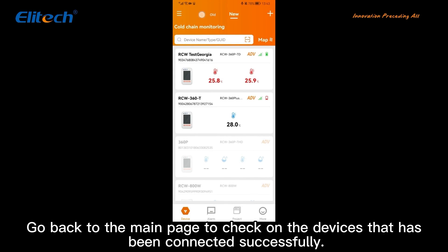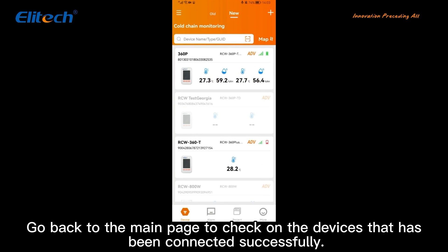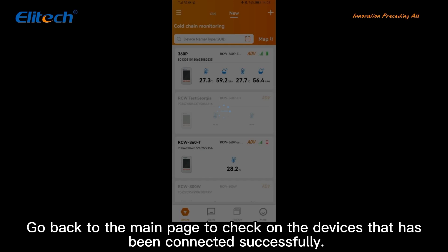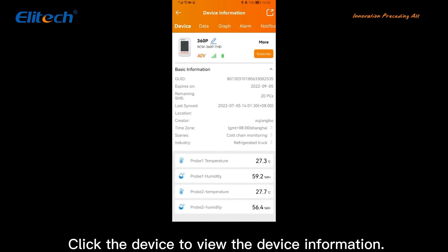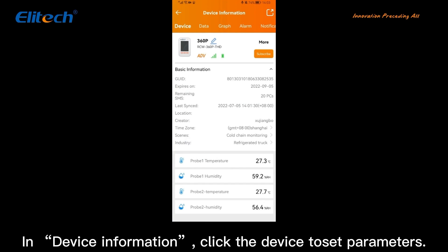Go back to the main page to check on the device that has been connected successfully. Click the device to view the device information. In device information, click the device to set parameters.